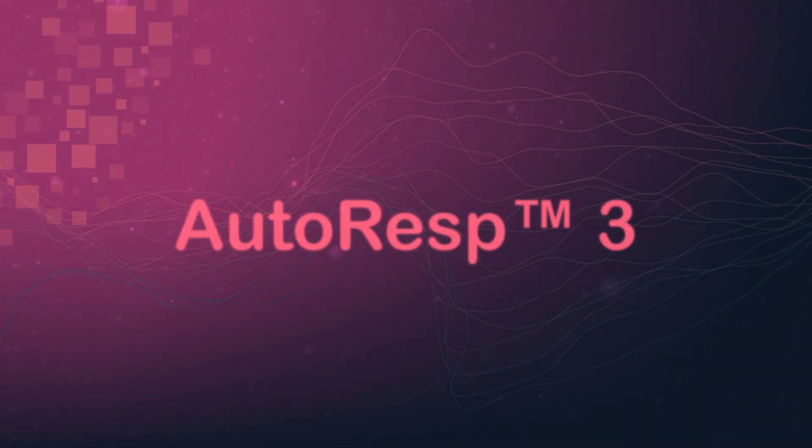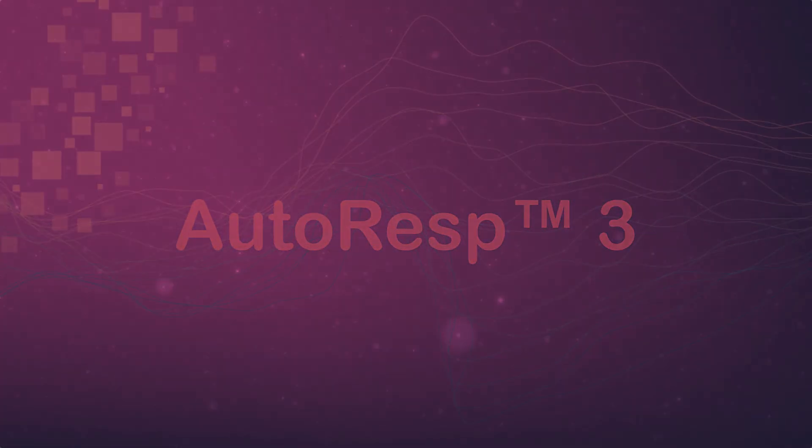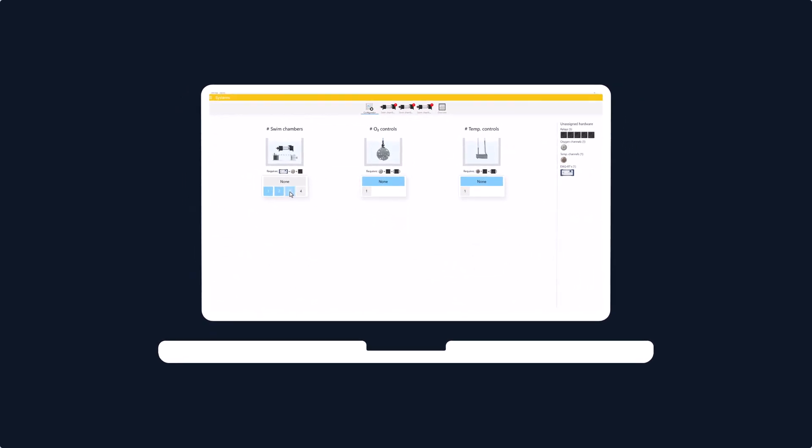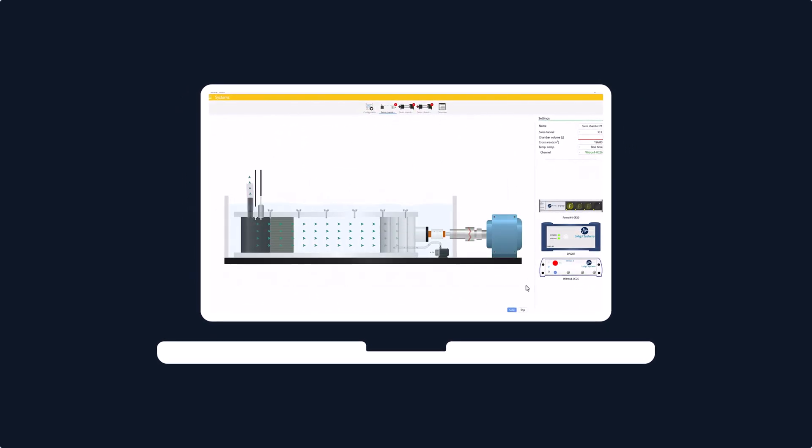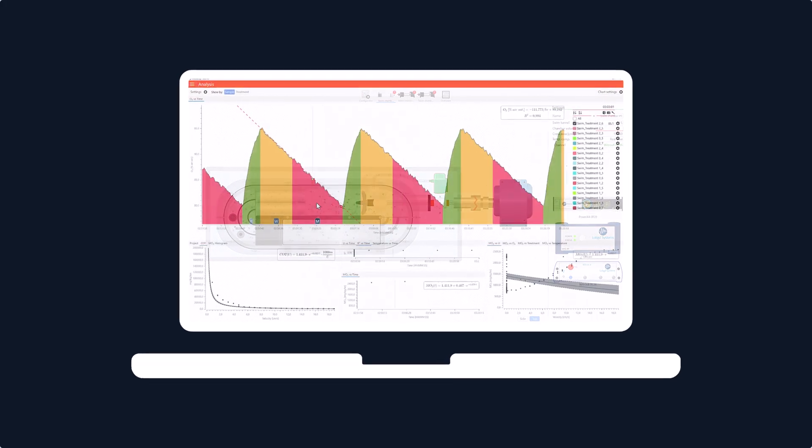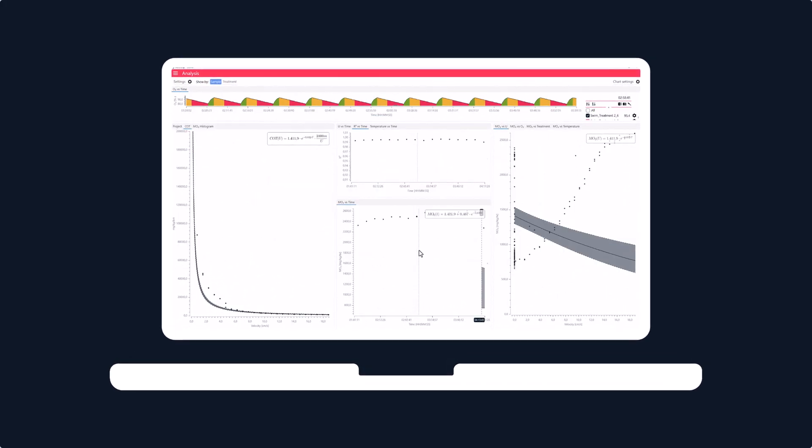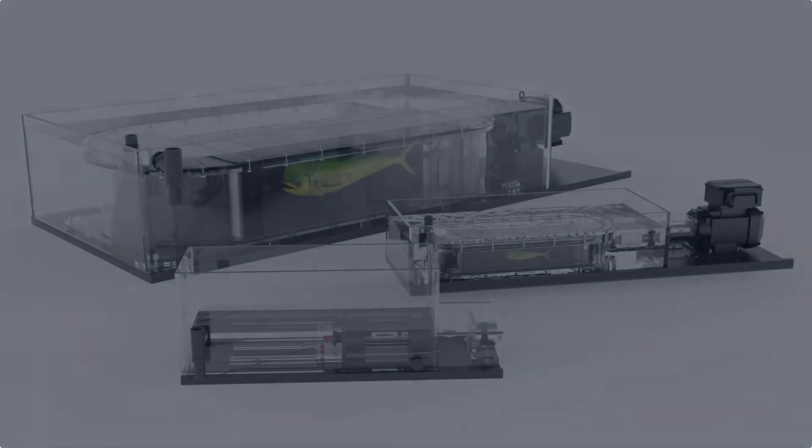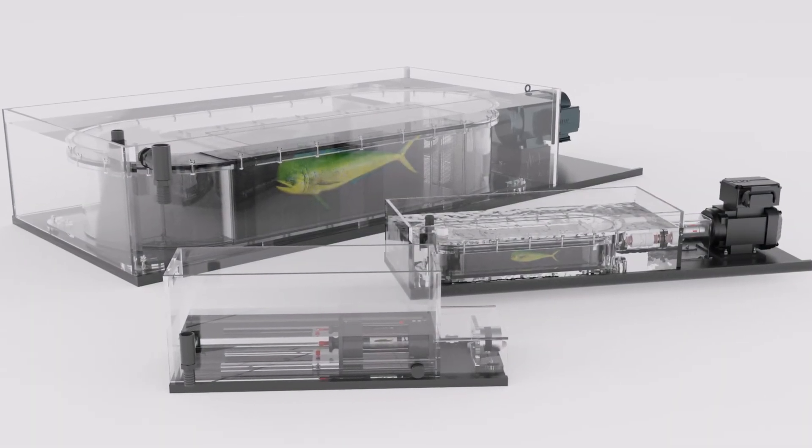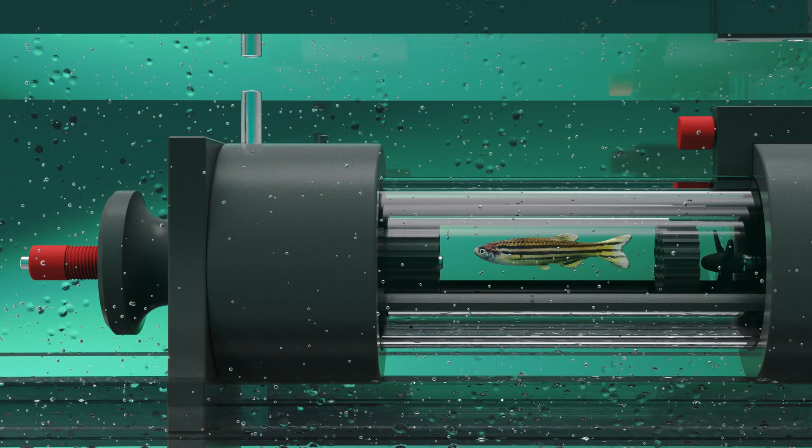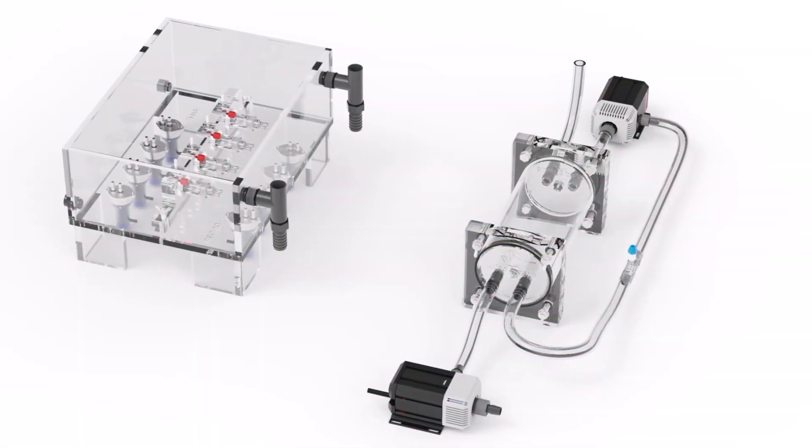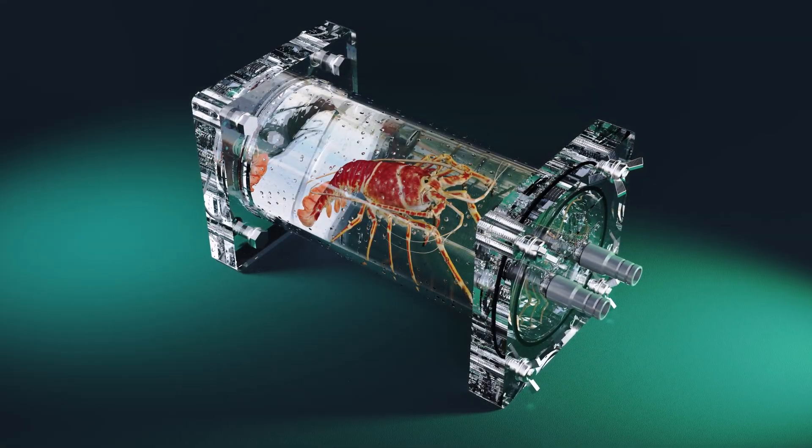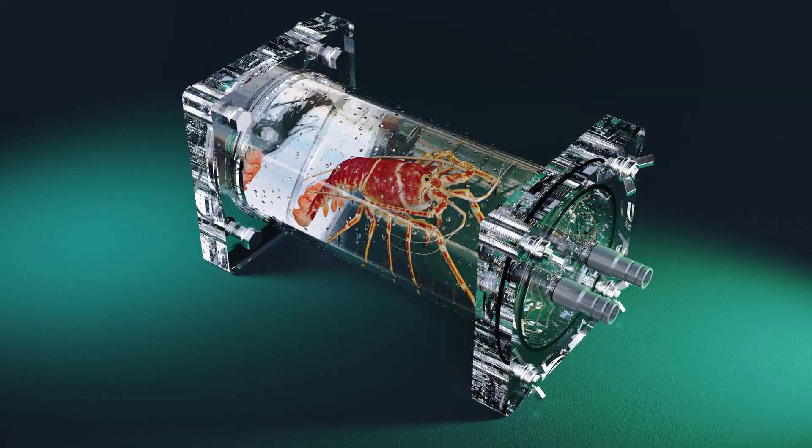Jumpstart Aquatic Respirometry with Autoresp3. Autoresp3 is a powerful and user-friendly Windows software for controlling, monitoring and analyzing intermittent respirometry experiments. This cutting-edge control center goes hand-in-hand with Lolligo swim tunnels and resting chambers and saves a lot of time for these often complex experiments.